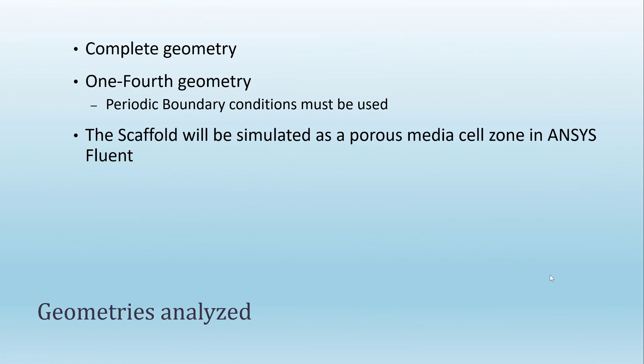The perfusion bioreactors can be modeled using different approaches. For example, we can develop a model for the complete geometry, but also we can use only one-fourth of the geometry. For doing this, we need to use periodic boundary conditions.